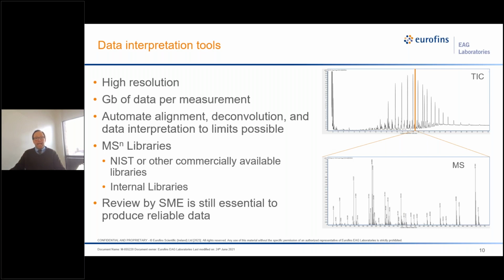Now, knowing that, you should probably be aware that the measurements conducted for this can be hundreds of injections or measurements per project. So, we can be talking in excess of 500,000 pages in hundreds of books that have to be gone through and that data interpreted. So I think it's pretty clear that doing a fully manual interpretation of this data is just not going to be able to thoroughly and accurately assess the data in a timely manner.